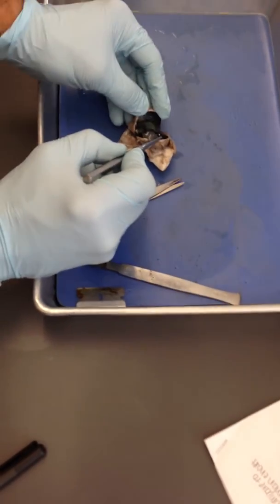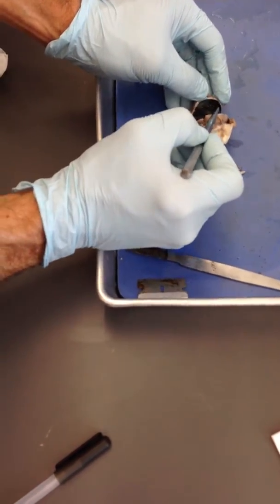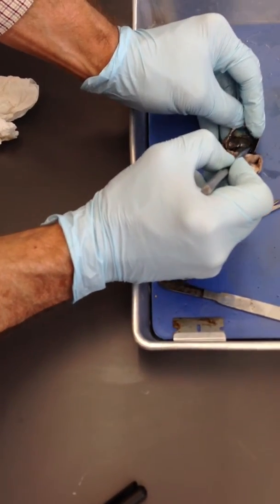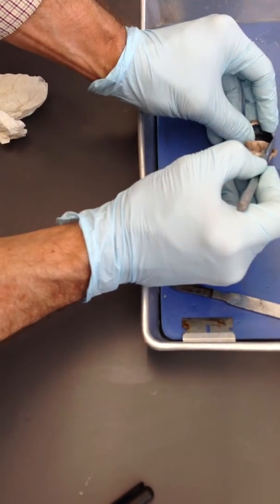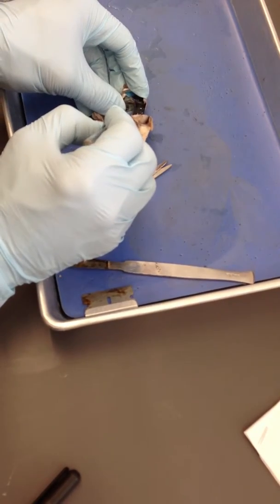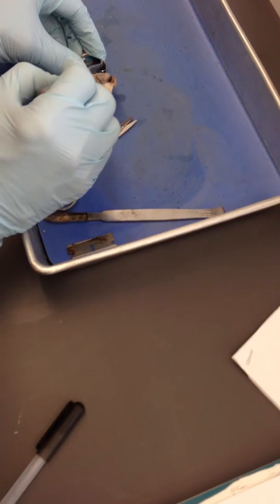All right, now let's take a look at the back of the eye here. So light would pass through that lens and get focused on this retina. Here's the retina, that little beige layer, very thin. I'm going to poke it. My fingers are getting in the way. I'm pushing the retina right now. It's beige, it's soft, delicate, and very thin. Okay, but that's the retina.